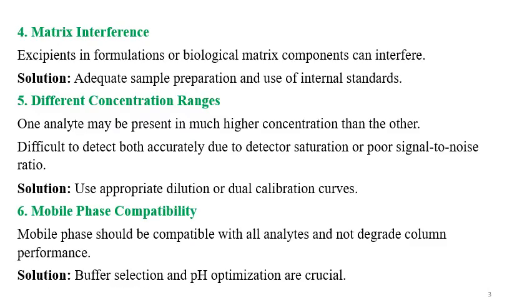Matrix interference. Excipients in the formulations or biological matrix components can lead to interference. Solution is adequate sample preparation and use of the internal standards. You can use different composition placebos to understand the interference.